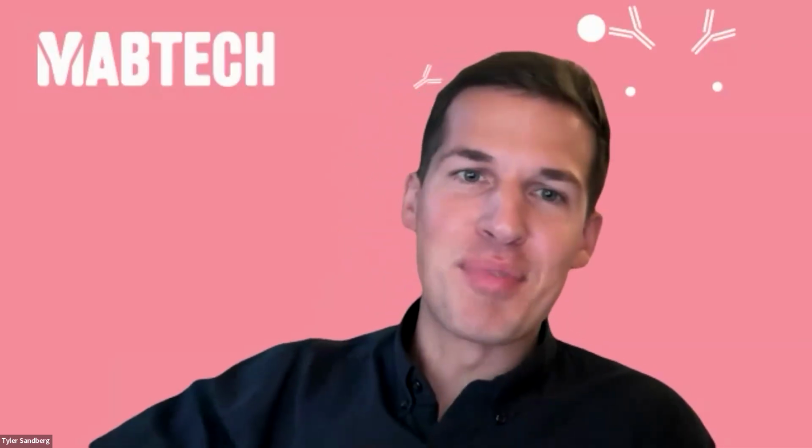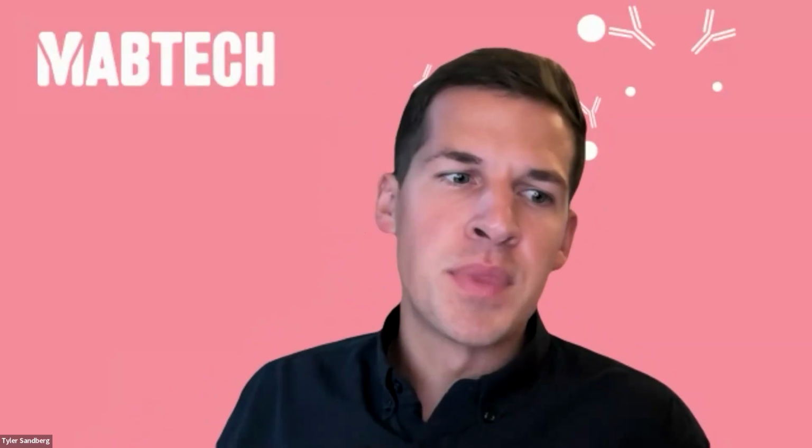Do you have some input there, Tyler? After thawing, generally, we've done a mixture of either using overnight resting, or sometimes we'll just go straight into the assay if we're pressed on time. But for some of these more important studies, it's definitely good to assess the outcome and assess using the antigens of interest that you're going to be using.